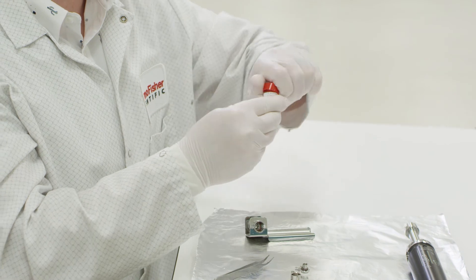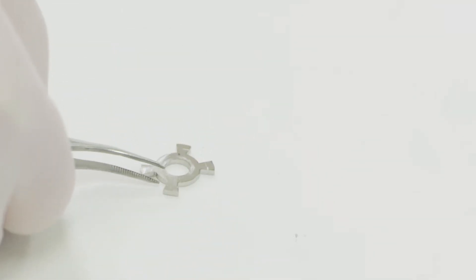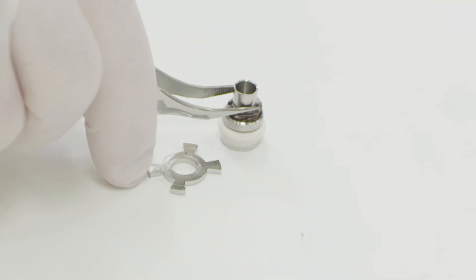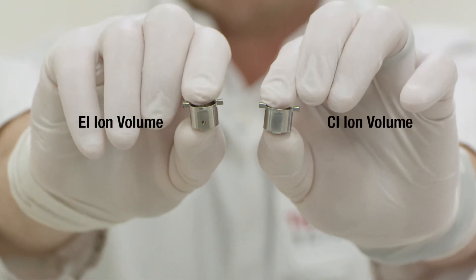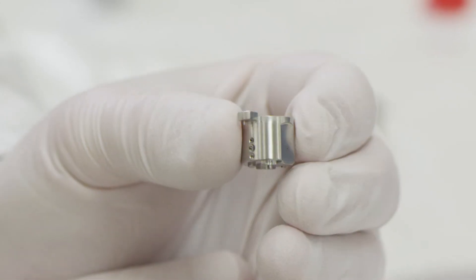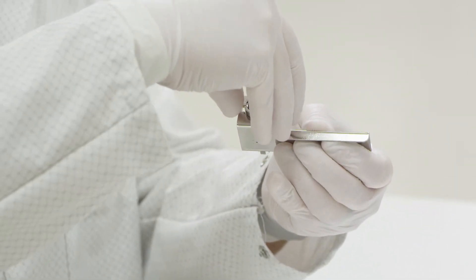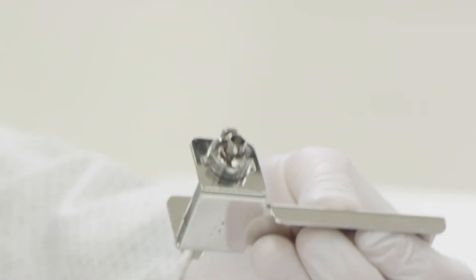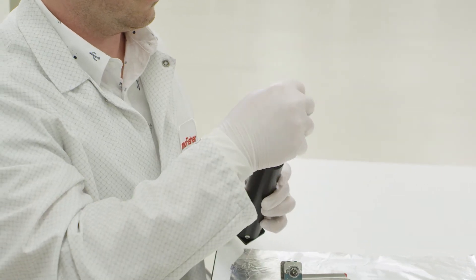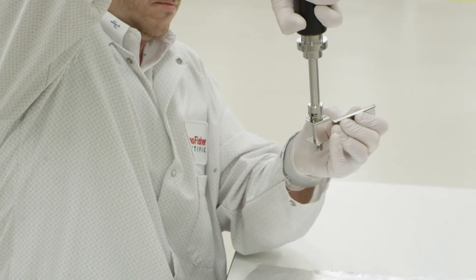The CI source module has its own ion volume and we will be installing that next. From left to right: the ion volume locking ring, repeller assembly with the repeller spring fixed, and the EI ion volume. We will replace this EI ion volume with the CI ion volume. Reassemble the source cartridge with the CI ion volume, then put the CI source cartridge onto the source removal tool.